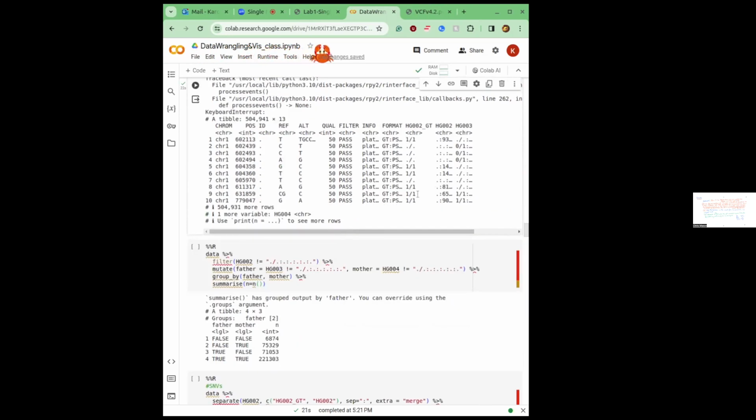If we pull them, you will see that some of them look like this. What does it mean? We have a dot, slash, and a dot. Any ideas? Yeah, it's not in the sample. Your intuition is good here. Since we have multiple samples in the same file, we basically have a row per variant, regardless of how many samples it is in. So dot slash dot for genotype means it's not in this particular sample, but it is in an additional one.